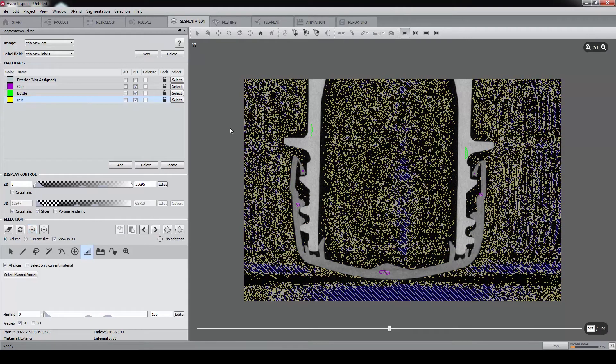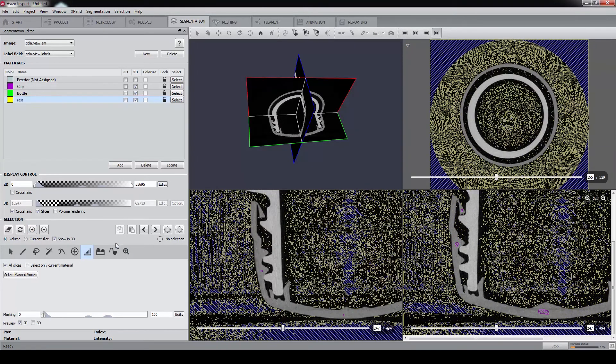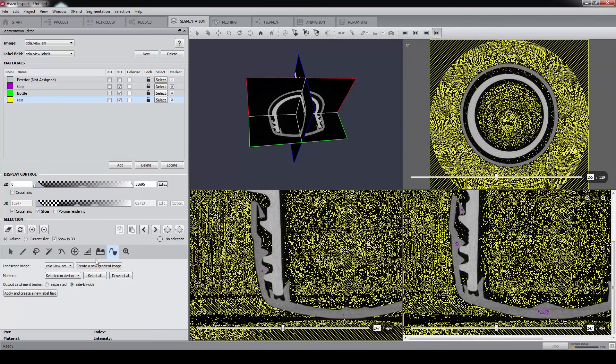Let's switch back to 4 viewers. Then we proceed to the Watershed tool, and create a new gradient image.